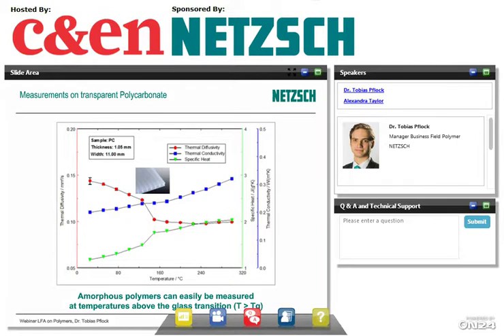However, DSC, differential scanning calorimetry, is a story on its own. It can do much more. So I would say it will never replace differential scanning calorimetry. But with respect to thermal conductivity, sometimes it's sufficient.